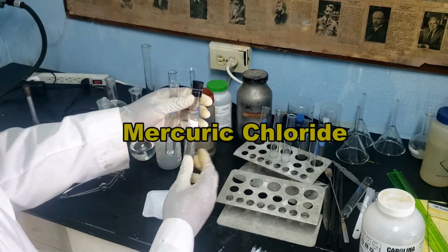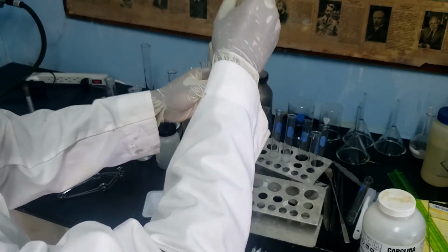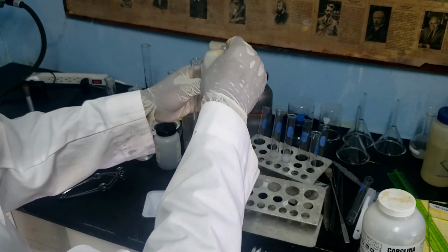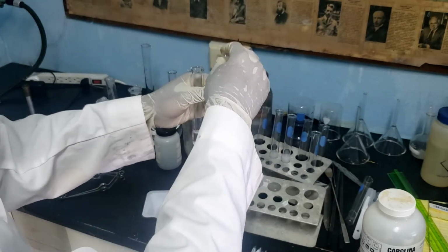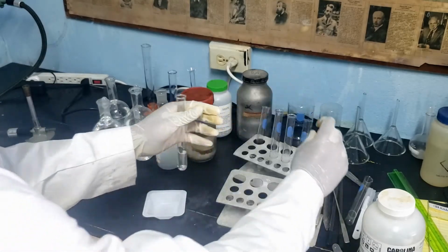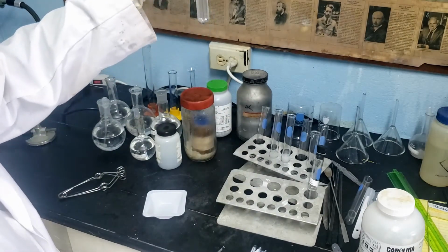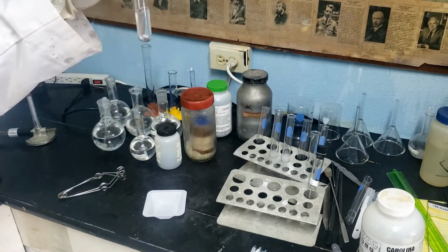Mercury chloride is a strong oxidizing agent that helps to remove the aluminum oxide layer and reacts with the aluminum metal. This then produces more aluminum oxide as more metal is exposed, and some of the mercury reacts with the aluminum to form an alloy.